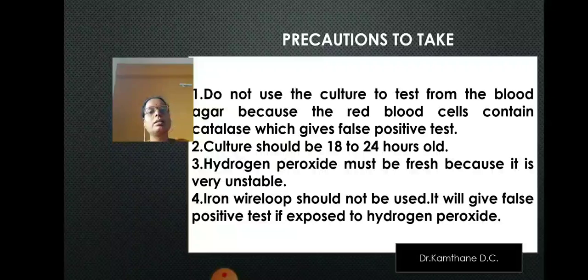Precautions: certain precautions we have to take while performing this catalase test. First, do not use culture from blood agar, because in blood agar RBCs are present and these RBCs contain catalase, and this may give a false positive test. The culture used for testing must be between 18 to 24 hours old.